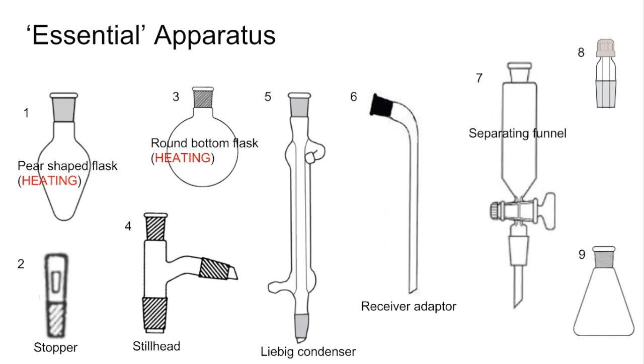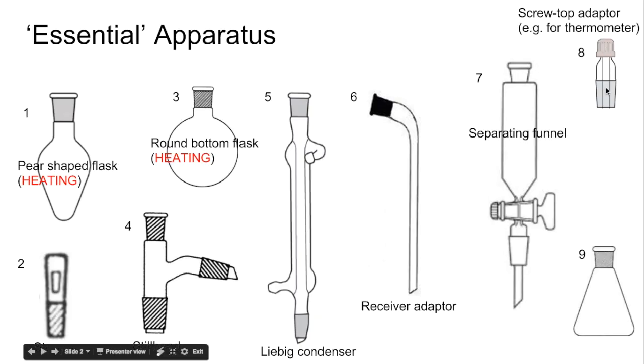Number seven is a separating funnel, which I'll come back to at the end of the video. Number eight is a screw top adapter — you could put a thermometer into it, which would typically go at the top of the still head to measure the temperature of the vapour. Number nine is a conical flask, used to collect substances in; the receiver adapter would go into it and the product drops in. Remember, conical flasks are not used for heating.